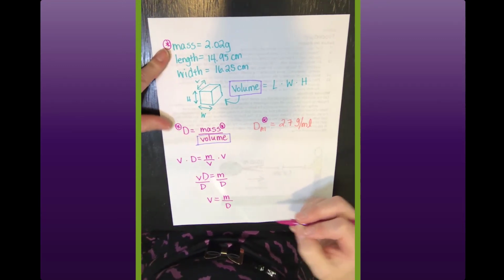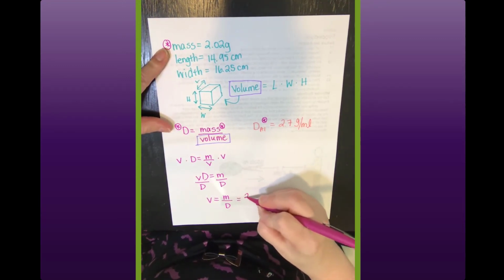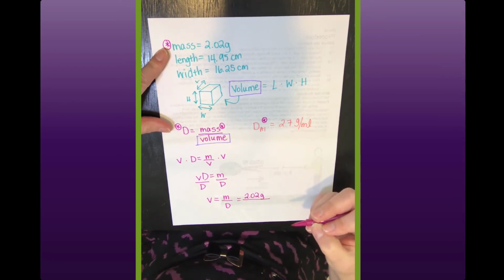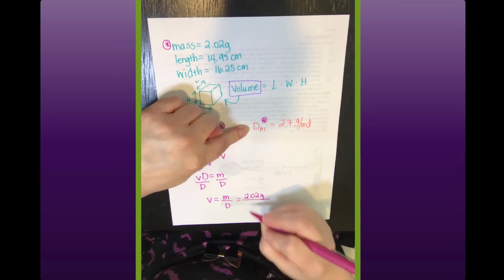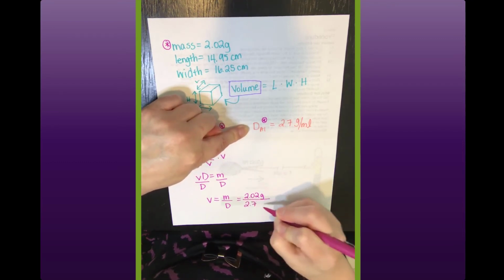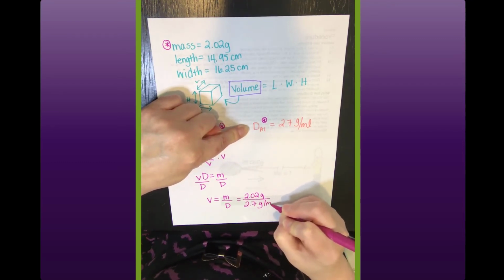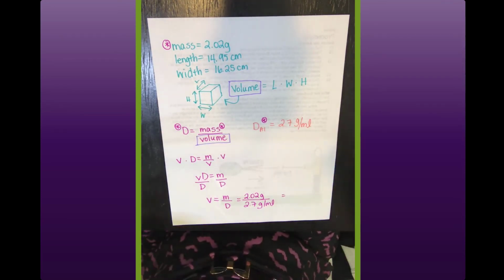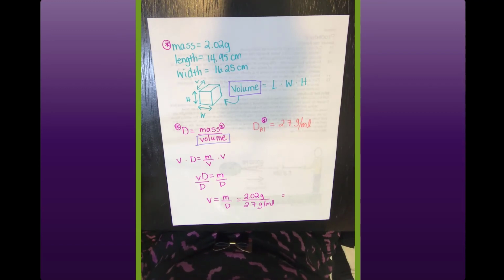And we have the mass. And we have the density. So, use my calculator on my laptop.